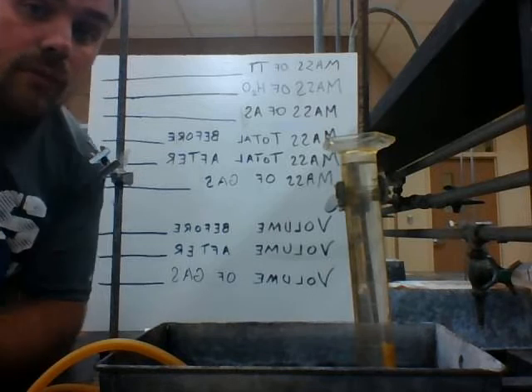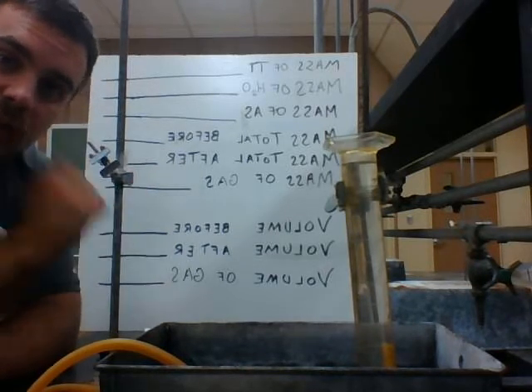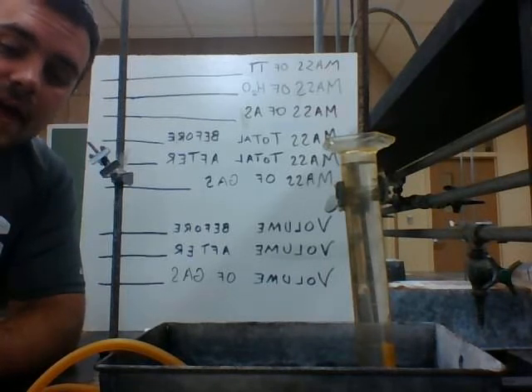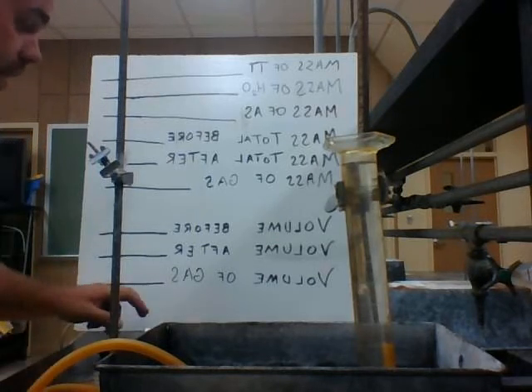So before you begin, you should have the following table written down in your composition books under lab C.1.5, density of a gas. So this is your data table.